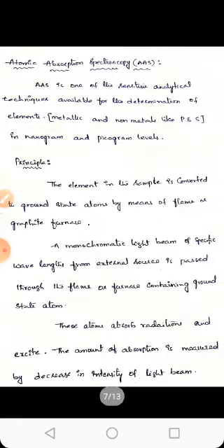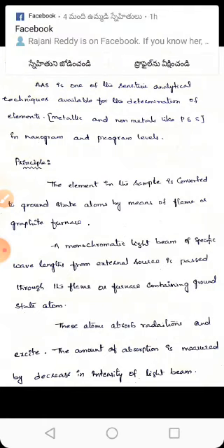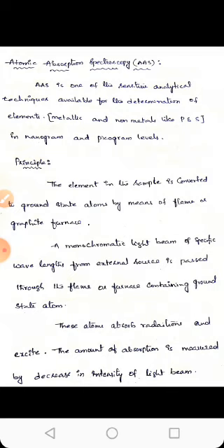And the next topic is atomic absorption spectroscopy. Atomic absorption spectroscopy is one of the sensitive analytical techniques available for the determination of elements present in a given sample at nanogram and picogram levels. That means it is a sensitive technique for the determination of elements, that is most metallic elements and some non-metals like phosphorus and sulfur, at nanogram and picogram levels.